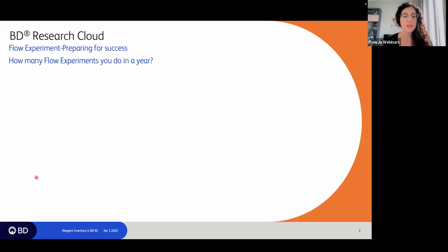Okay, first thing first, I would like to ask you how many flow experiments you do in a year. You can type it in the chat if you want, or you can send me a specific private message.